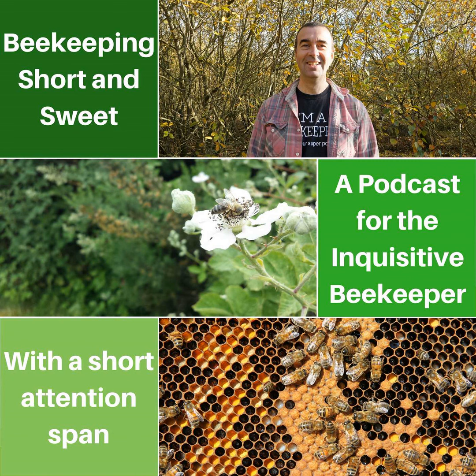But then if you wanted to dissect a bee, you can't use one of these high power microscopes. You have to use a low power stereo microscope. So you actually need two instruments. Sure. But that doesn't necessarily mean it's that expensive.